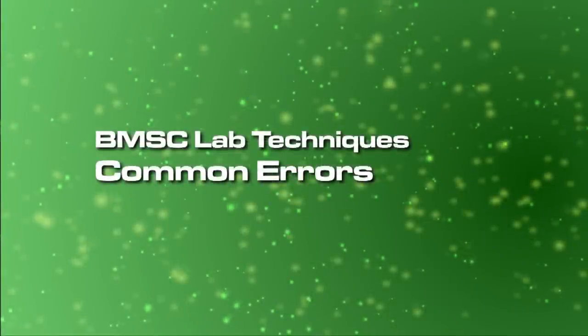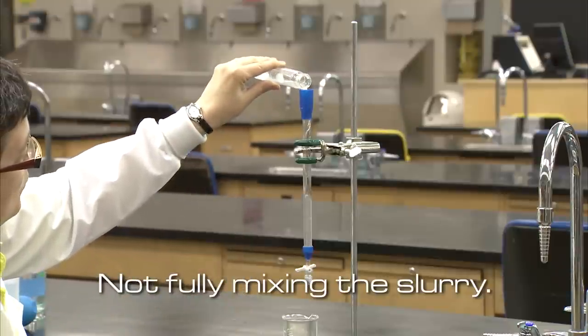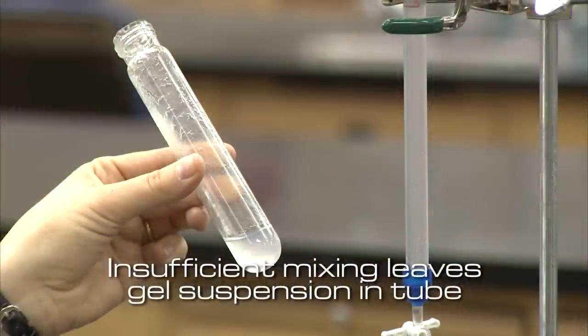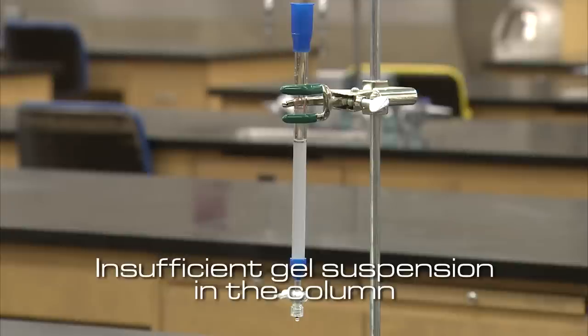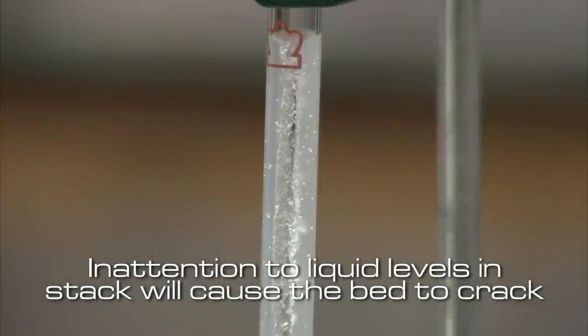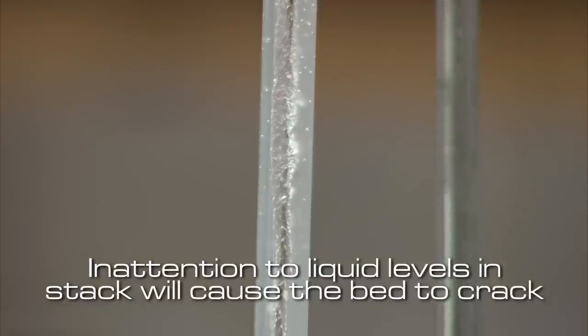Some common mistakes we have observed are: not mixing the gel beads completely, which leads to some remaining in the bottle and results in a short column that will not separate proteins properly; pouring buffer directly into the column, which will lift and mix the gel beads; and failing to maintain the buffer level, which can result in the column drying out and cracking.